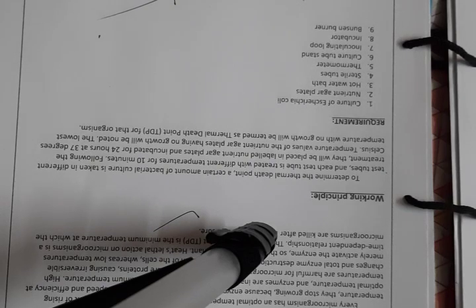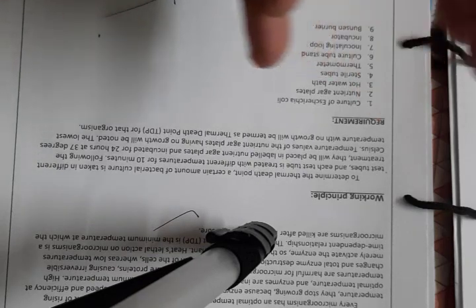That's it. Oh no, actually, without using 6 test tubes, we can just use one for each. So till now we have got that we require the bacterial culture, then nutrient agar plate, and then what I was saying.